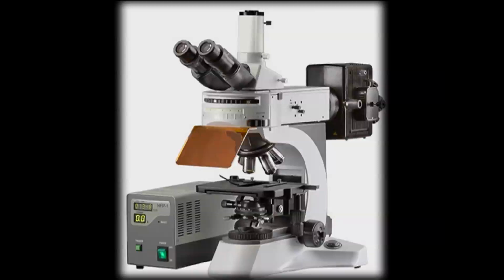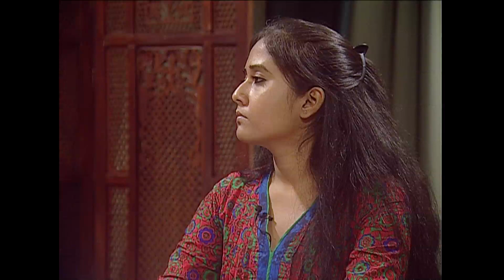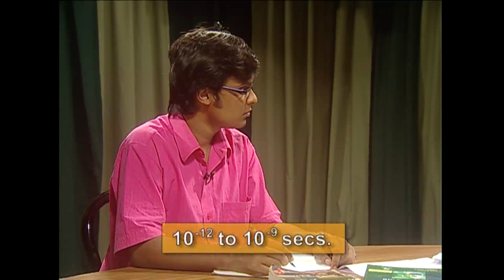Second, there should be sufficient energy difference between the ground state and the excited state of the atoms, so that when the electron again comes back to its ground state, it releases the energy in the form of a photon. Another important aspect to remember during fluorescence is the time span. It happens within 10 to the power minus 12 to 10 to the power minus 9 seconds. So such is the low time span.